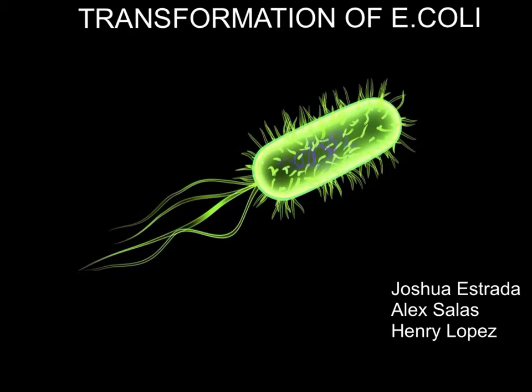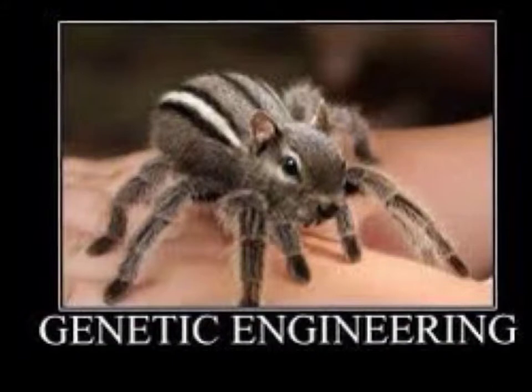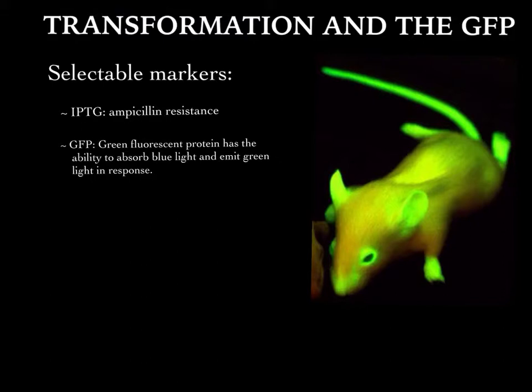In this experiment, bacterial transformation, a method in genetic engineering using biotechnology, was used to change the genome of sample E. coli. Genetic engineering allows for genes to be removed, added, or even modified from an organism's genome. Certain bacteria are able to transform their genome by taking in and incorporating exogenous genetic material. This transformation occurs naturally, but can also be achieved in the laboratory.